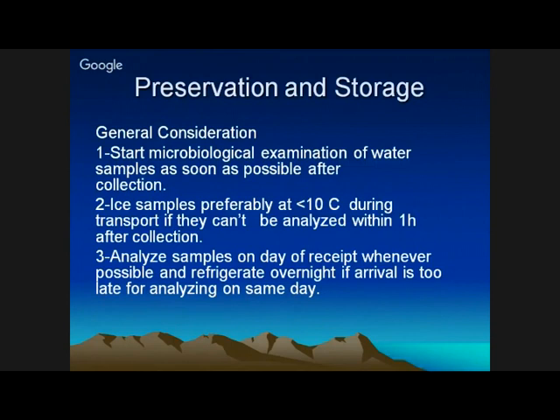If you analyze the sample after 1 or 2 days, you will not find any bacteria present in that sample. So you have to analyze immediately if you have collected a bacteriological sample in the field.